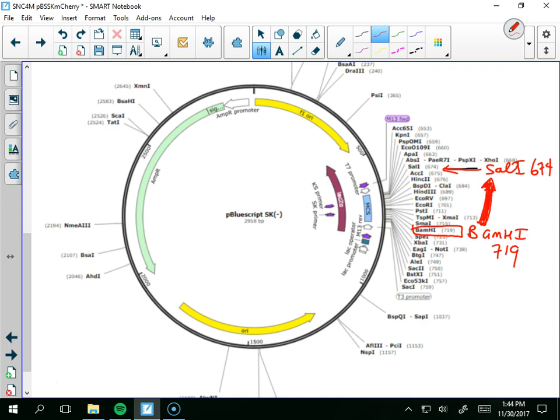All right? Really important to understand the tools that you're using and the way they need to be used when you're doing this. And you might be doing this in the future. It's very possible. This technology is kind of like workhorse level technology now. It seems very new and it's not. Okay? It's decades old, actually. But it's kind of the basics.